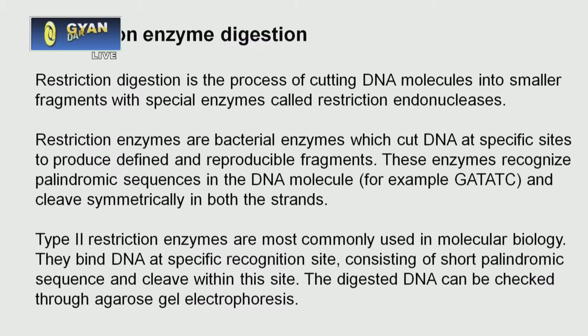And most of the restriction enzymes that we use in molecular biology belong to the type 2. Actually, there are different groups of restriction enzymes which probably you will be studying in your genetics and animal biotechnology course of your M.Sc. Zoology program. And there you will be studying the details of all these restriction enzymes. But since we are discussing the practical part here, we will not be elaborating too much about the theoretical part. Rather, we will learn how to cut the DNA, how to do the practical part.